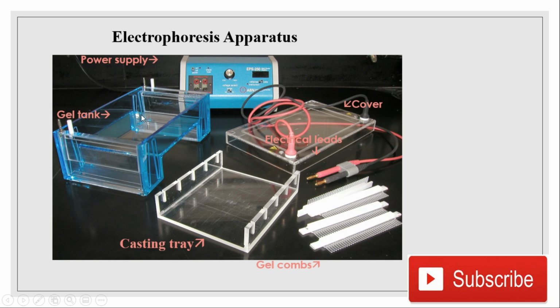Because if it is open, we have the electric charge. So the person who is using it might be at risk of electricity during the working operation. So it should be covered with the cover to avoid this problem.